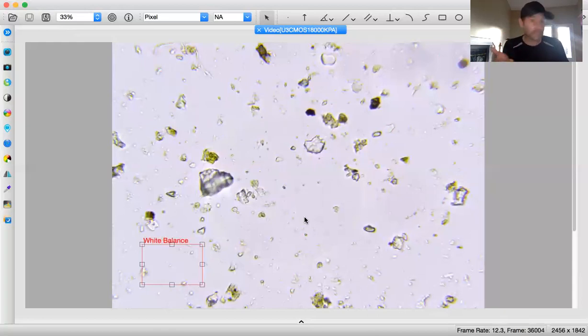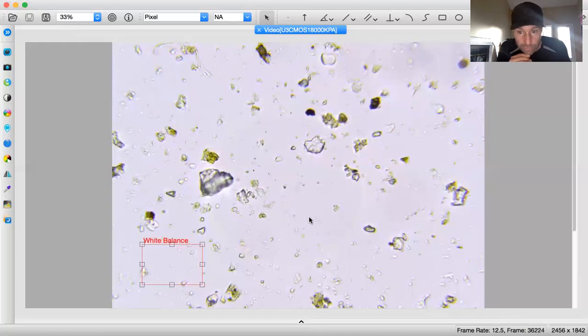And since the soil food web hasn't indicated to me which I should be recording, and the definitive measures on this, I can't record what that is. But I think that's a cercozoa personally because it is bobbling and it has a milky consistency inside. It is not clear. So I really hope somebody gets back to me on that one. We will see, but yeah, can't record it. Lack of information from the school, unfortunately.